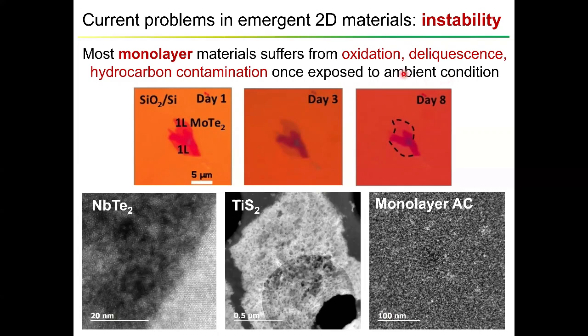For conventional bulk TEM, surface contamination is maybe not a big problem because we still have a lot of signal coming from the inner part of the bulk. However, in 2D material, the bulk is the surface, right? And once the surface gets contaminated, all the efforts in digging out the structure are in vain.